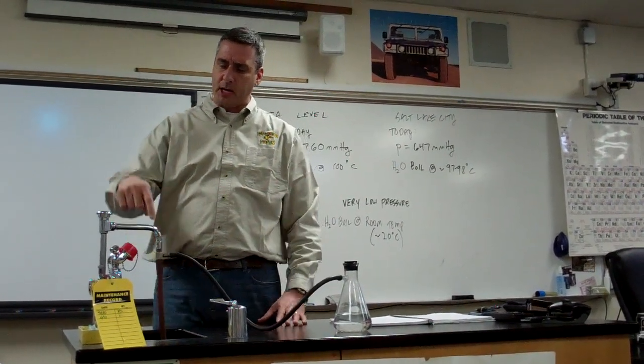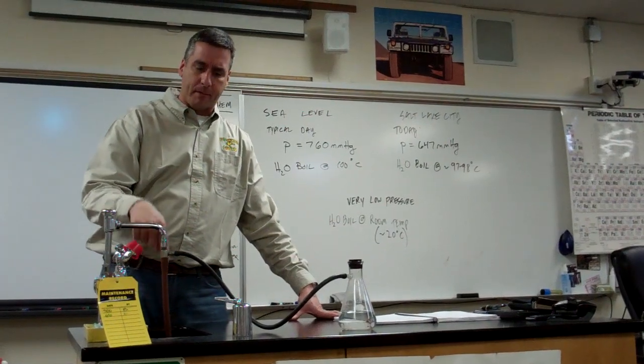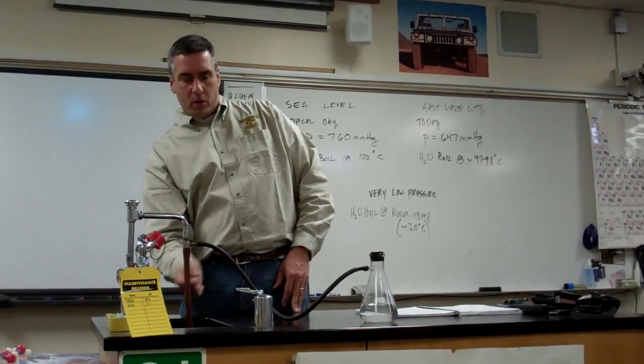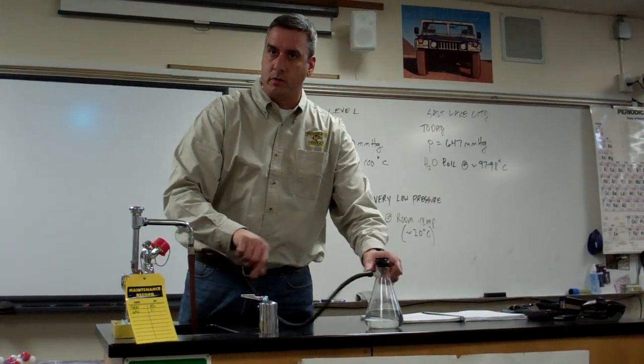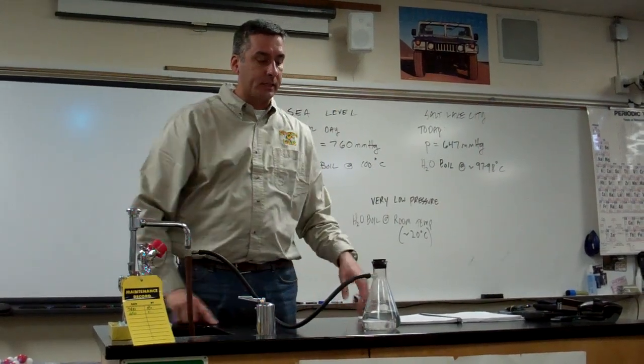You might think that sounds sort of strange, but as water pours through this tap, the water will pull the air out of this tube, which of course is connected to this flask.